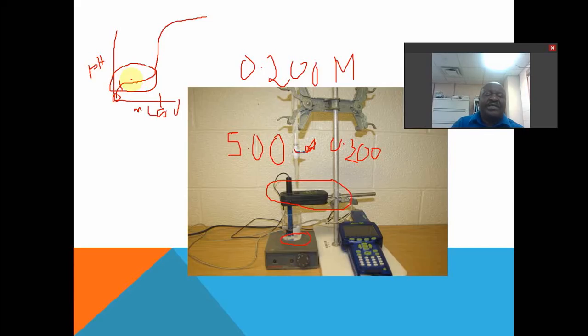So that's why at this point, pH is equal to pKa, because the log term vanishes. Good. At the equivalence point, if we're titrating HA, we've converted all of the HA to A minus. So, wow. If it's A minus, and A minus is weak base, I expect the pH to be basic. Can I calculate it? And so you have that exercise as part of your pre-lab. So you're going to write a hydrolysis reaction, and you're going to use a Kb expression to do this calculation.